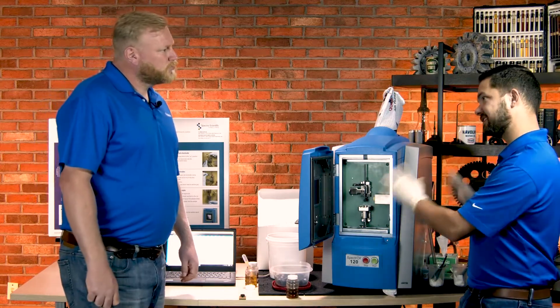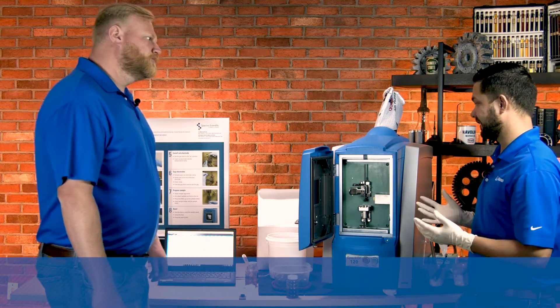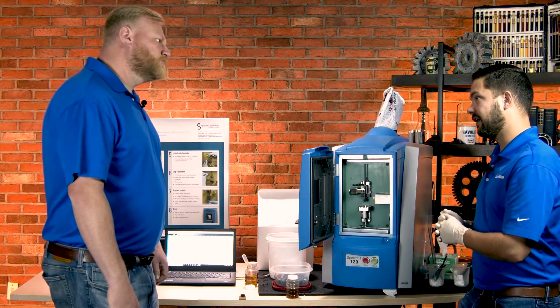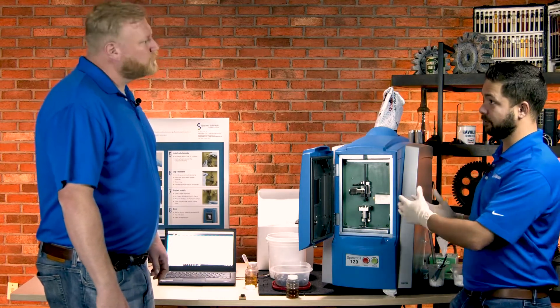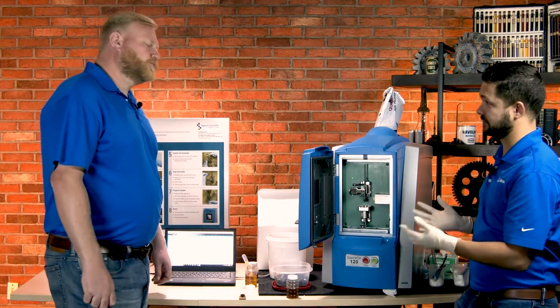Everything has an ASTM standard to follow, so it's been standardized for quite some time. I was able to run samples pretty quickly. We recommend having a field engineer come in to help walk through the initial setup, but it only takes a few hours.